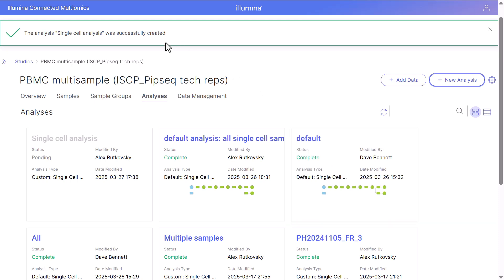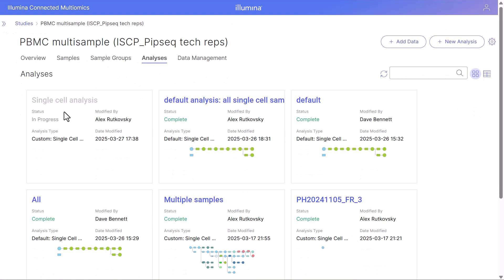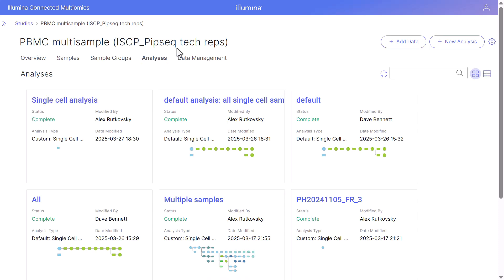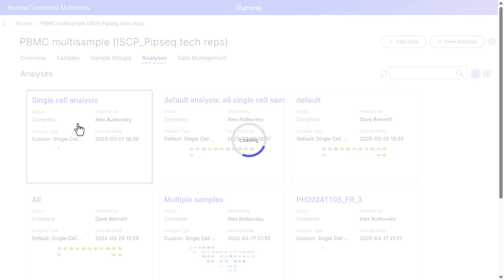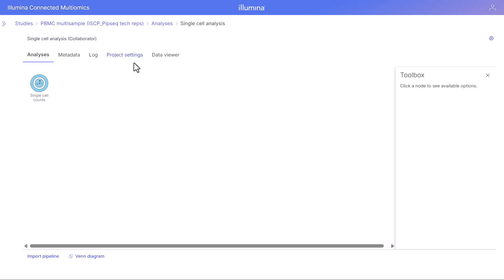The analysis was successfully created and we can see the analysis status has moved from pending to in progress, and now from in progress to complete. Let's go ahead and open this analysis. When we hover over the single cell counts node, we can see there are two samples here.